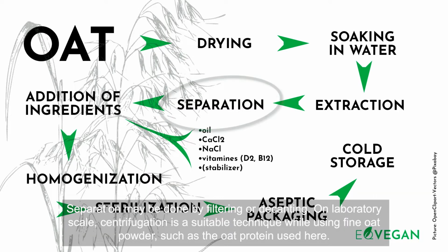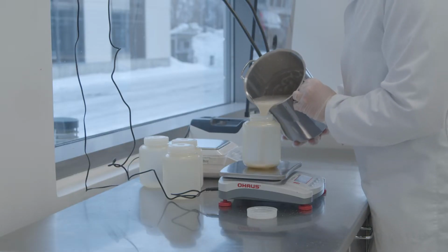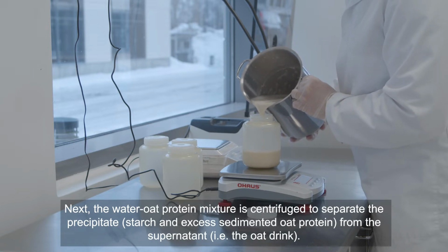Separation may be done by filtering or decanting. On laboratory scale, centrifugation is a suitable technique while using fine oat powder, such as the oat protein used here. Next, the water oat protein mixture is centrifuged to separate the precipitate from the supernatant.